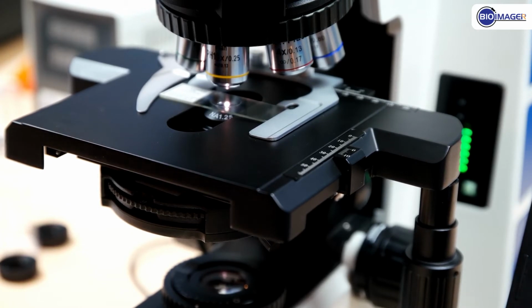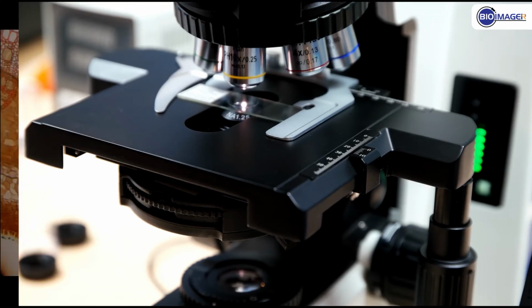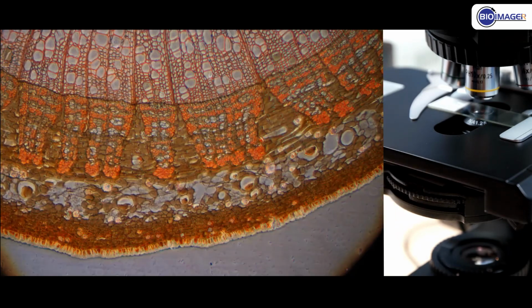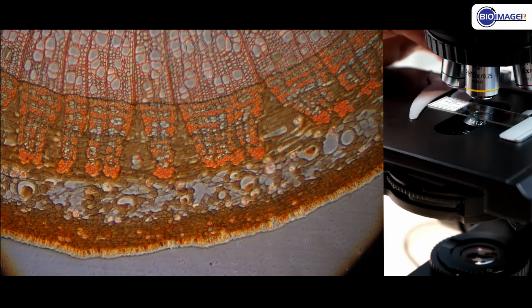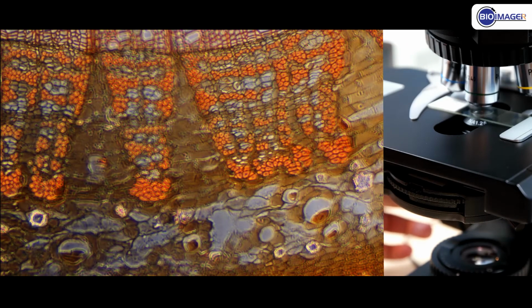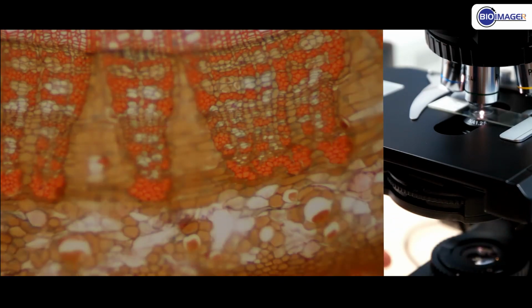In this video we are going to look at a sample which is Tilia or basswood using different objective lenses. At this moment we are seeing the image using a 10x objective lens in bright field mode. So let's switch to 10x phase contrast from the condenser, and here you can see the image difference. We can retune the focus. Next I'm going to switch to 20x objective lens, and we can align the focus, and I come back to bright field. You can see the difference between these two.